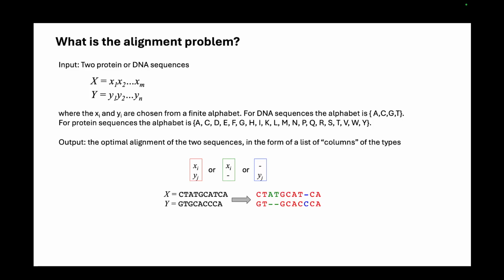We use these reference genomes to tell us from where our reads originated, and what the difference in our reads is compared to the reference genome at that particular position. So it can tell us about mutations, and about different types of variations in the genome. It is a very important step in handling of NGS data.